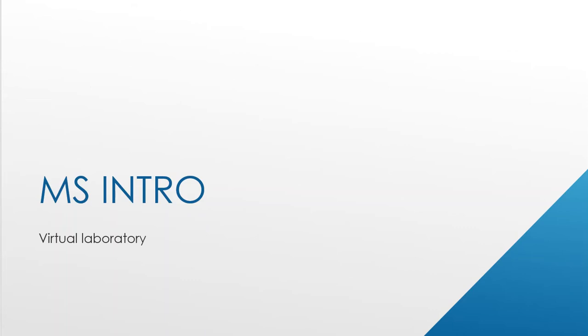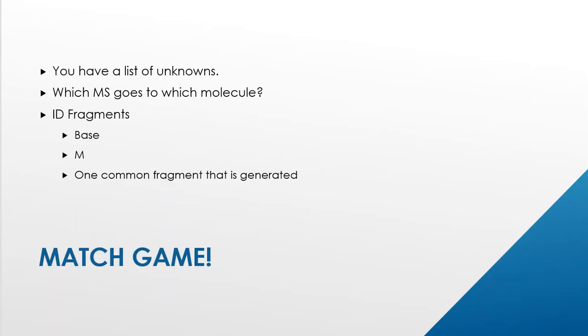In this laboratory experiment, we're going to be focused on a very similar activity to what we saw in infrared. Basically, I'm going to play the match game one more time, and I'm going to give you a series of different unknowns that you can choose from, and it's our job to match the names of those unknowns to the mass spectra that we have obtained from the piece of equipment together. The list of unknowns will be found in Blackboard.